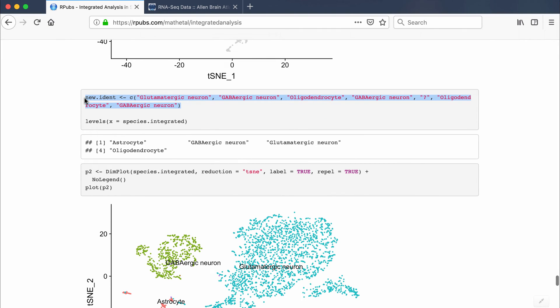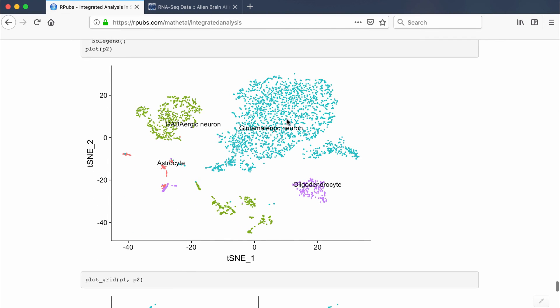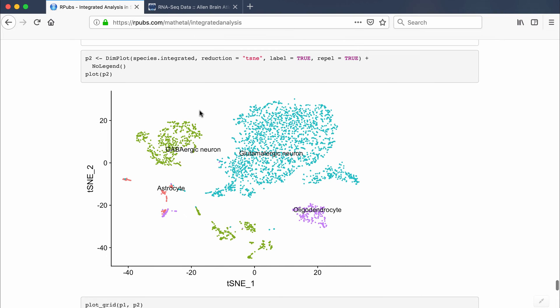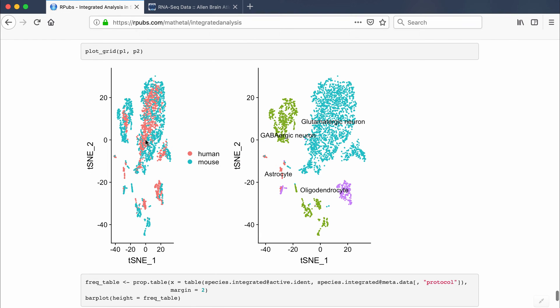In the next section I assign the cell IDs for the different clusters in the integrated object. I identified four different cell types across the integrated object and use these labels in the t-SNE plots. The following code plots the combined integrated object separated by Seurat clusters with their assigned cell IDs, and another plot shows the two t-SNE views side by side — one by species type and one by cell ID type.